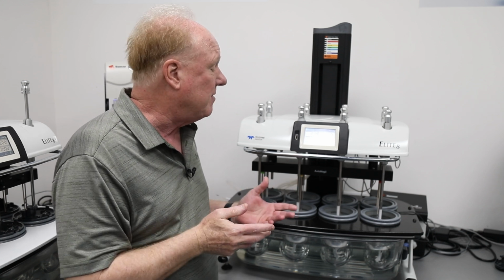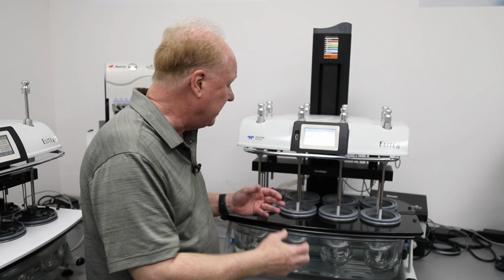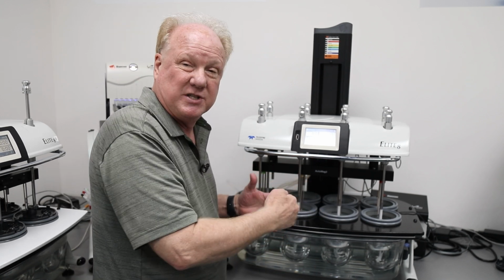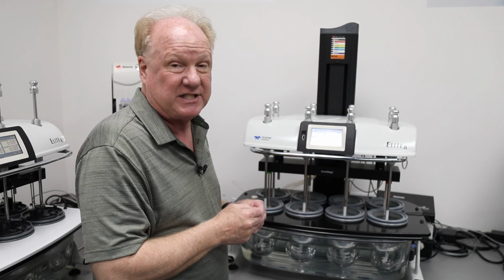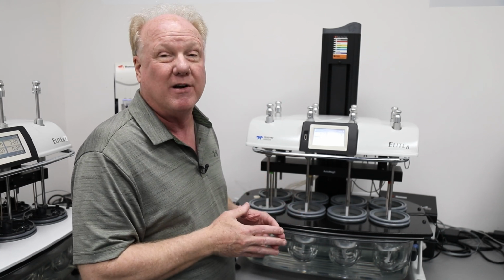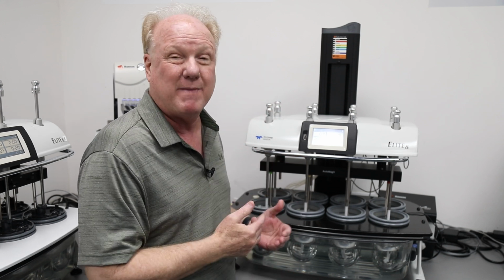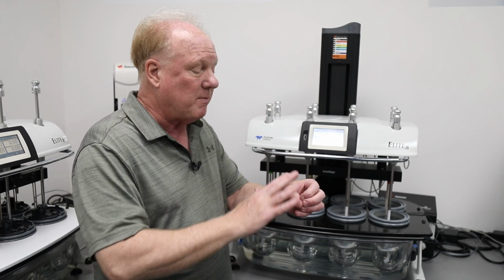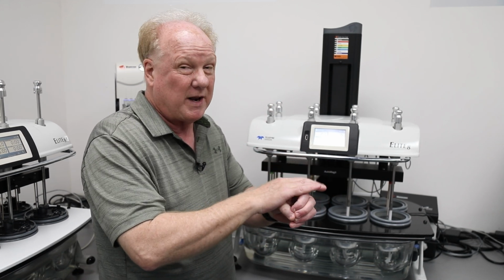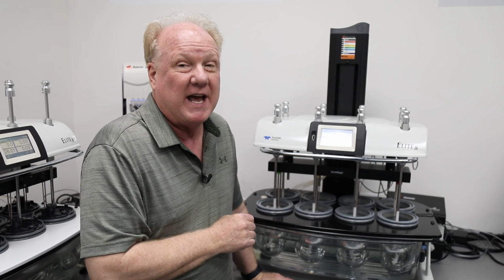Also, when we transfer the media into the vessels, we want to do so in a slow manner so as not to introduce a great deal of turbulence, which will also increase regasification of our media. Now, again, a good clue to what's going on here are the amount of bubbles that you see in the vessel. If you see a large amount of bubbles, or if your dosage form is covered by a large quantity of bubbles, that might be an indication that you need to reevaluate your degas procedure.